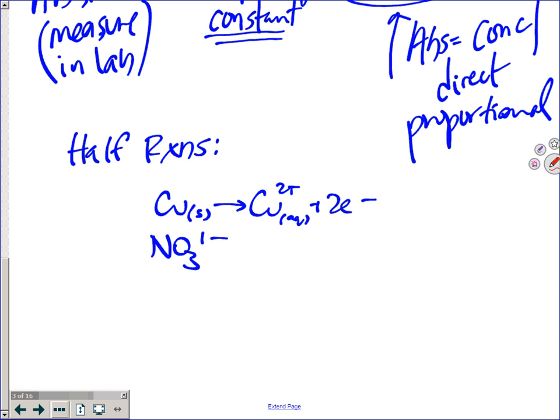So the H makes an ion, because it's a strong acid, right? If it were a weak acid, I would not be separating those. It's a strong acid. So that produces what? NO2 gas. So nitrogen dioxide is a brown hazardous gas. Okay, so keep going, Marcus.